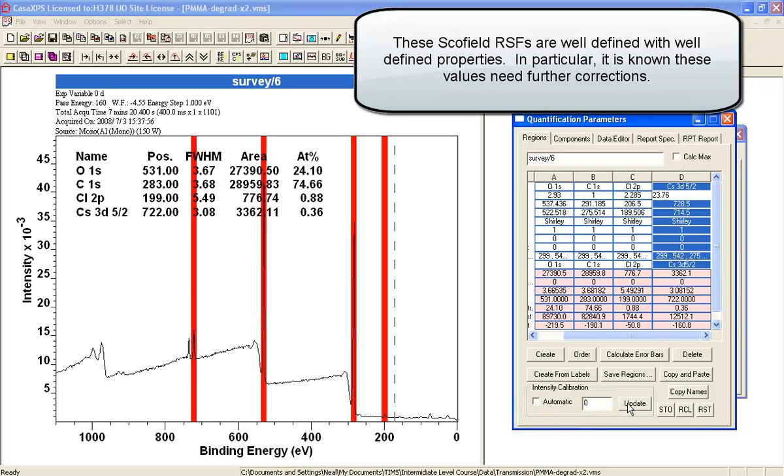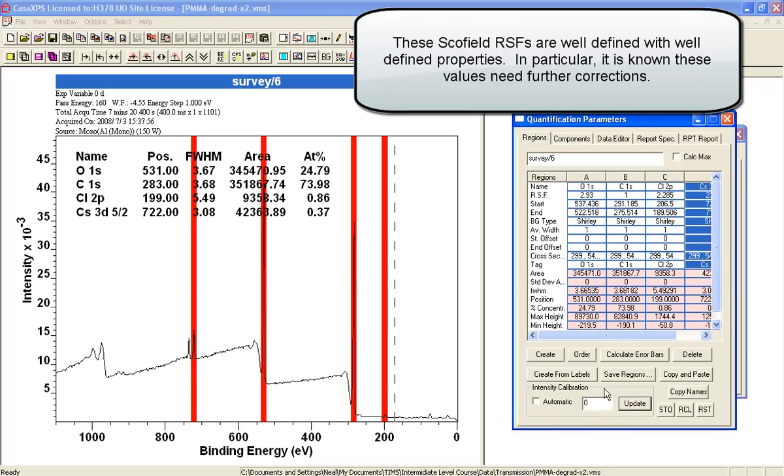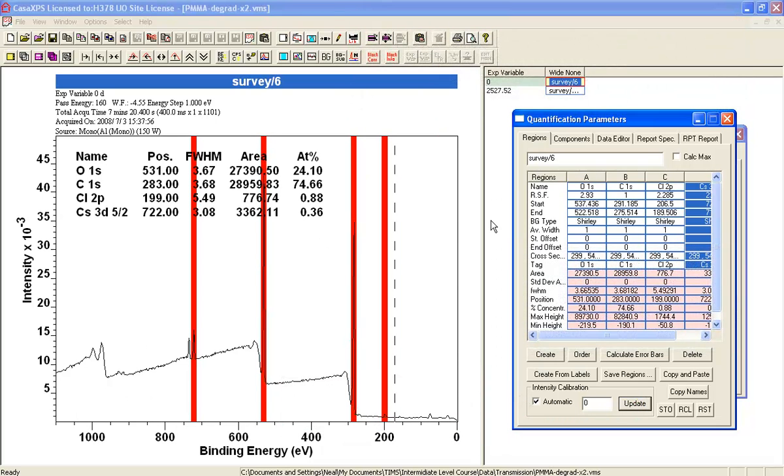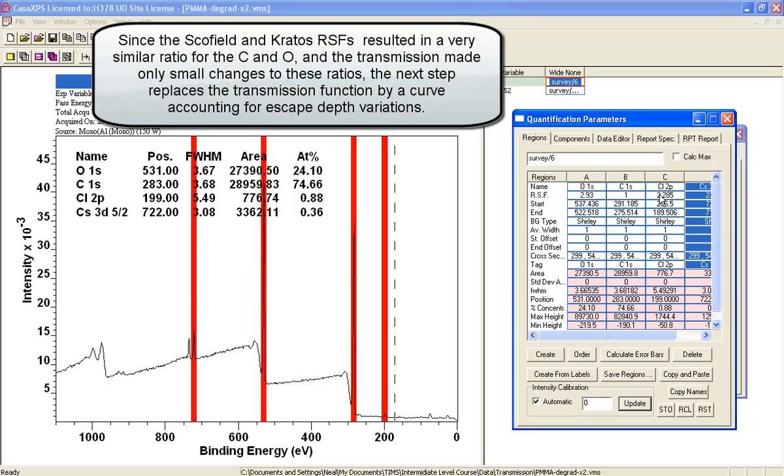The value hasn't changed a great deal. If we take off the transmission function, you can see that again there's some change but not a lot. The Schofield cross sections and the values entered by the Kratos library are doing something very similar.